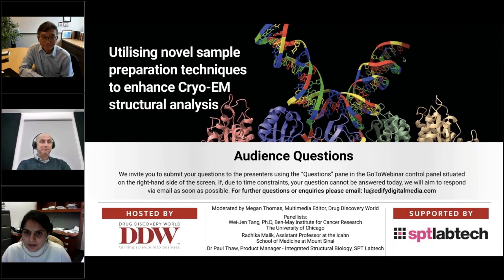Yeah, you're right on. Detergent would be the first thing I thought about. Would that be CHAPSO or something different? Yeah, we've tried CHAPSO, but it hasn't worked for us. So you have to try a bunch of detergents. I think Jena sells a kit with a bunch of detergents, like 12 or something. So you can try DDM, all of that. It hasn't worked for us yet. Same here.